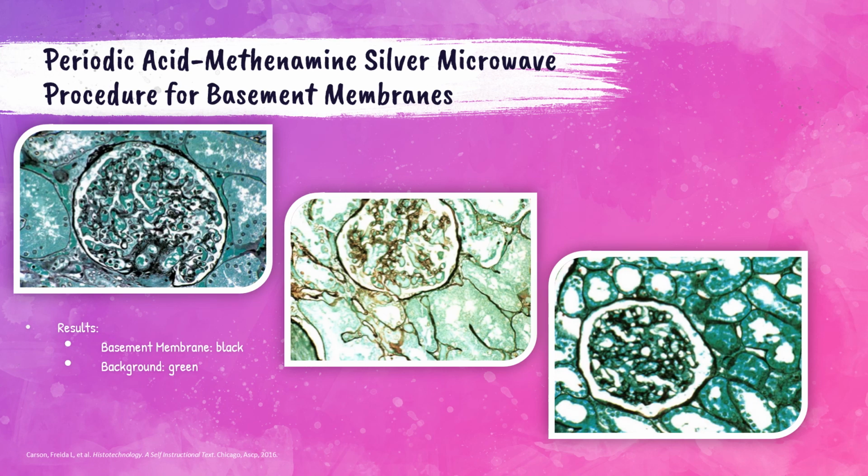The middle photo of the slide shows another kidney glomerulus stained with this stain. This has been understained. The photo on the far right-hand side of the slide shows an overstained kidney glomerulus. So this is also too thick of a section to be stained. Recall that the tissue should be cut at 2 microns for optimum staining using this method.